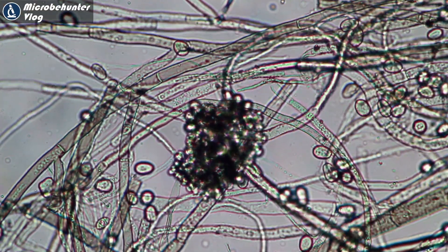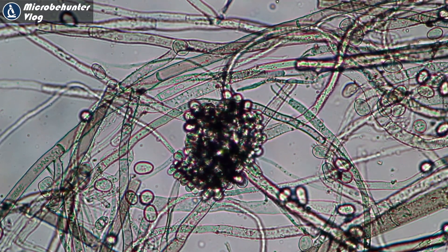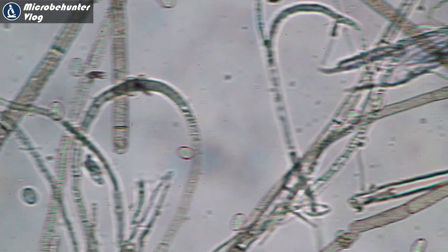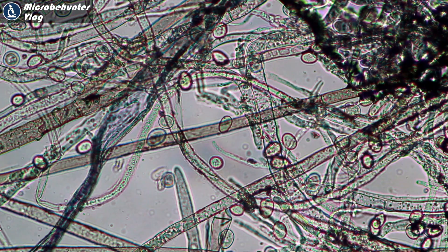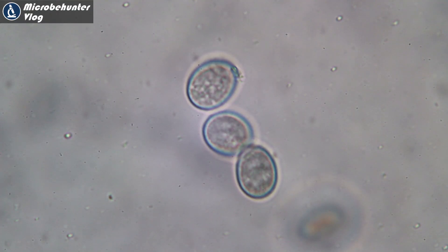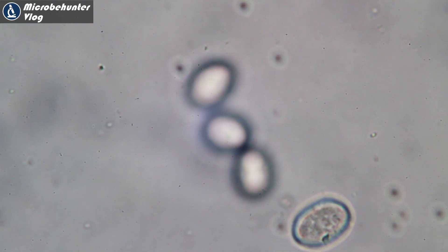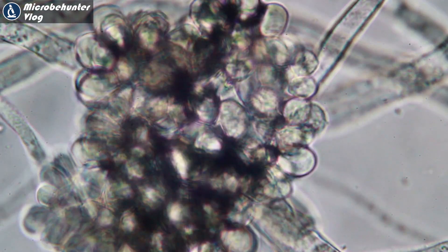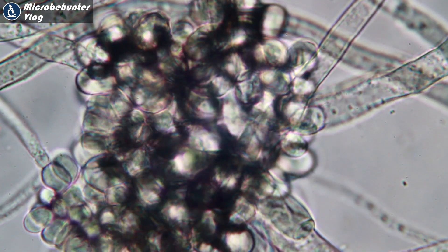I picked up a new sample and I was successful. Look at this — this dark round structure in the middle is the so-called sporangium and it's forming egg-shaped spores, and there are plenty of spores now visible. These spores scatter by air and start to form a new fungus. I've zoomed in a bit more to see the structure of the individual spores better. There are three of them next to each other, and the liquid around them is flowing by because the spores seem to be squeezed between the cover glass and the slide — they stay fixed while the liquid on the outside flows. Here is a close-up of the sporangium and you can see the individual spores a little bit like grapes growing together.